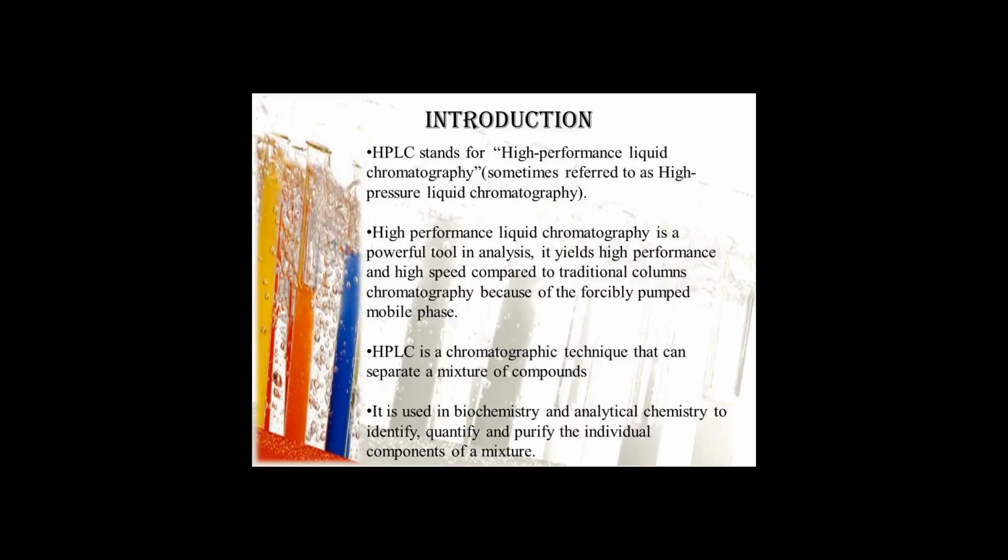Research. Similar assays can be performed for research purposes, detecting concentrations of potential clinical candidates like antifungal and asthma drugs. This technique is obviously useful in observing multiple species in collected samples as well, but requires the use of standard solutions when information about species identity is sought out. It is used as a method to confirm results of synthesis reactions, as purity is essential in this type of research. However, mass spectrometry is still the more reliable way to identify species.